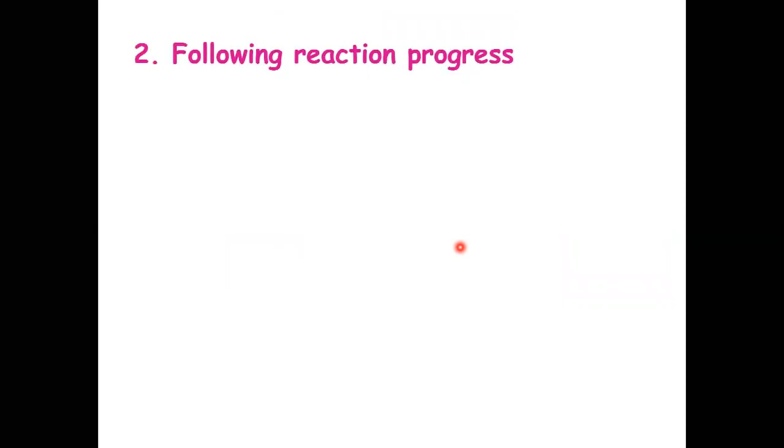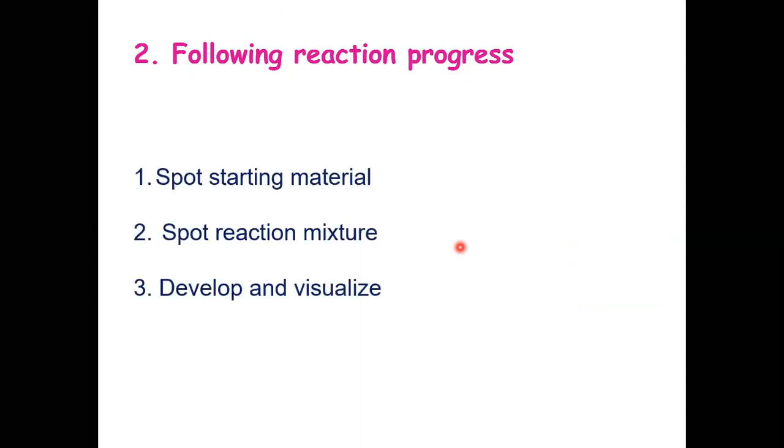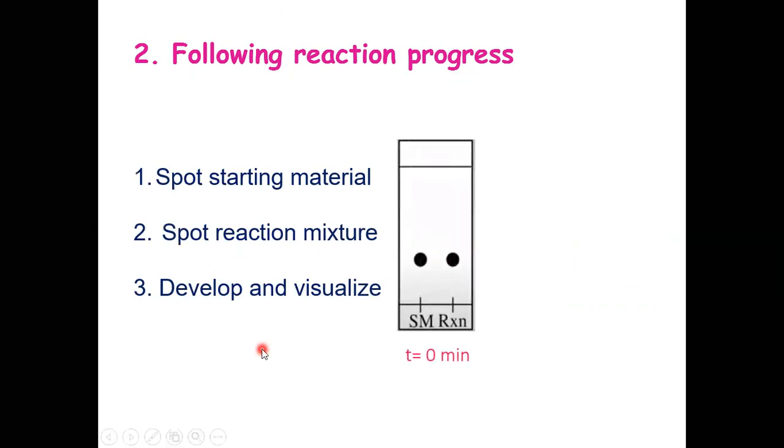Second application: following reaction progress. If we want to check the completion of the reaction, three steps are there. Spot the starting material separately, and the reaction mixture. At 0 minutes, there are two similar spots, which shows that in the reaction mixture only starting material is present at the beginning.